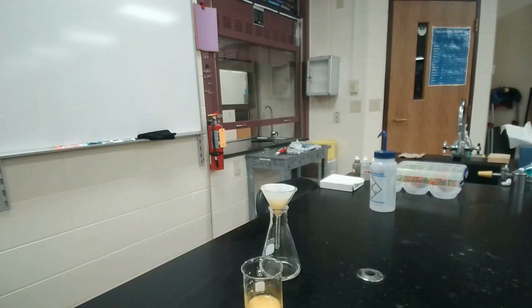You will have to subtract the mass of the beaker that we took at the start, and the mass of the filter paper, so that we get just the mass of the precipitate. That is what we're doing here. Okay? So I'm going to stop the video. I'll come back when I'm ready to show you what it looks like right before it goes in the drying oven.